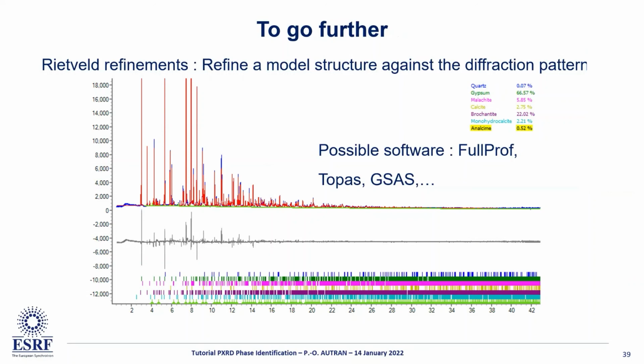So for example, in this case I presented in the talk, it's still very difficult because you see it's lost in the crystal, and I did a roughly good job, but it's very difficult when you turn to this kind of software. But I guess this is everything you need to know.